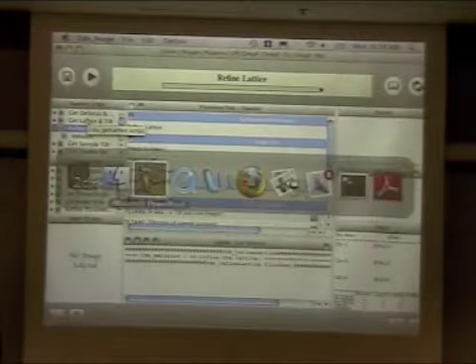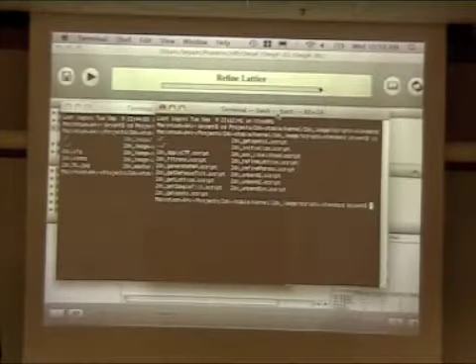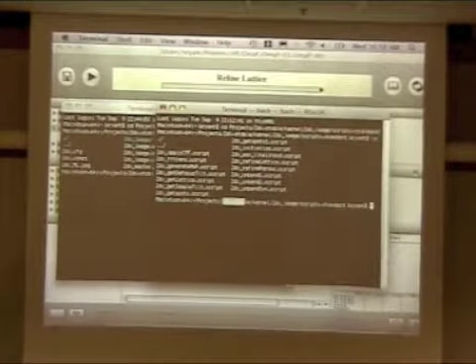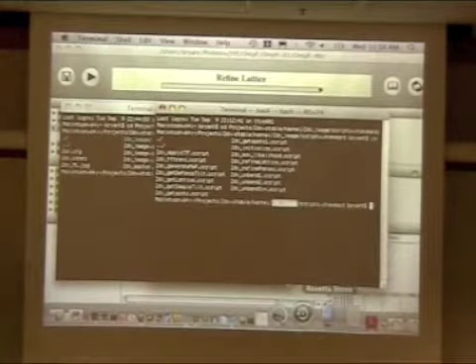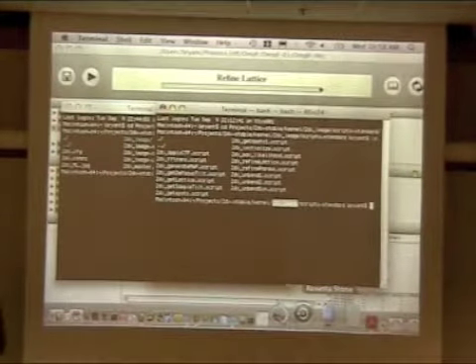Now, these are populated individually from your install location. When you install 2DX for the first time, wherever you've installed it, just ignore this first bit, inside of there's going to be a little thing called kernel, and inside of kernel there'll be a 2DX image and a 2DX merge directory. And inside of each of those there's going to be some script standards and some scripts custom.